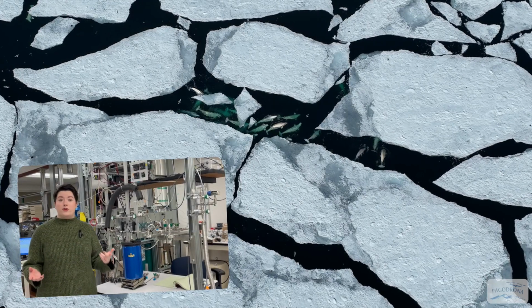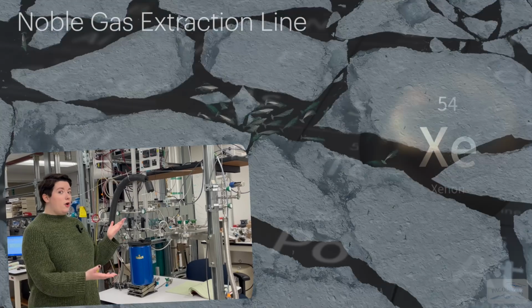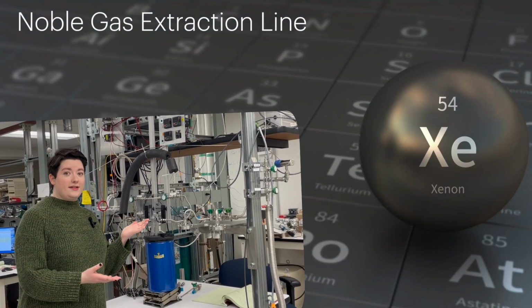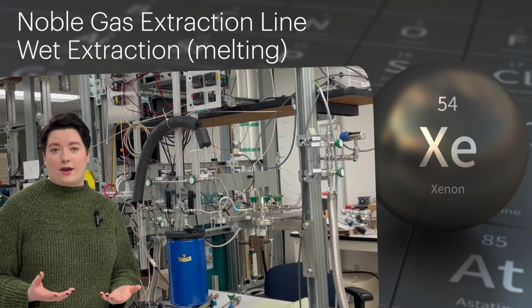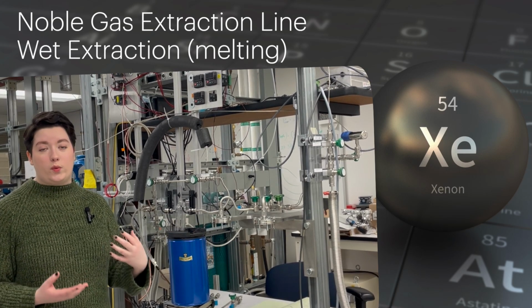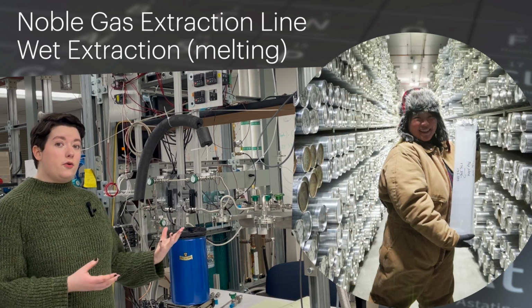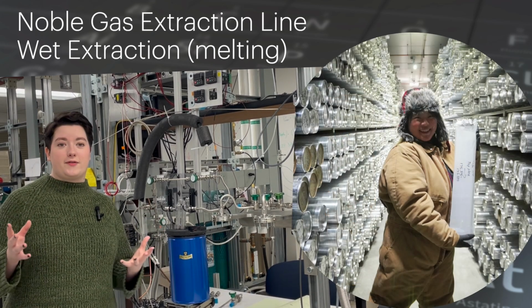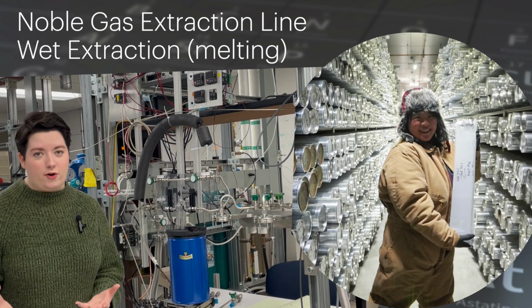You know that we can use noble gases to understand past ocean temperatures. Here's our own noble gas extraction line here at Oregon State. Like the methane line, this setup uses wet extraction, where the ice samples are melted once the room air has been vacuumed out. Measurements for mean ocean temperature need large samples of ice, up to several kilograms, to capture very small changes over a long time.